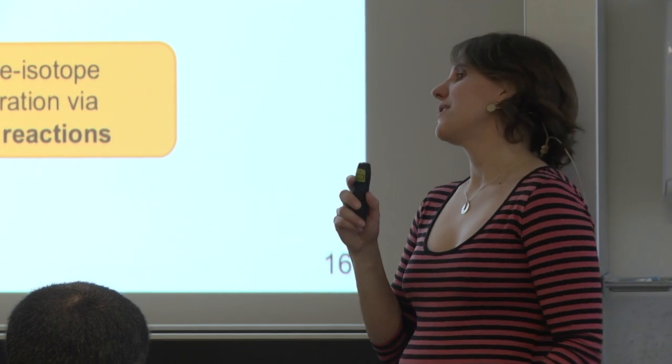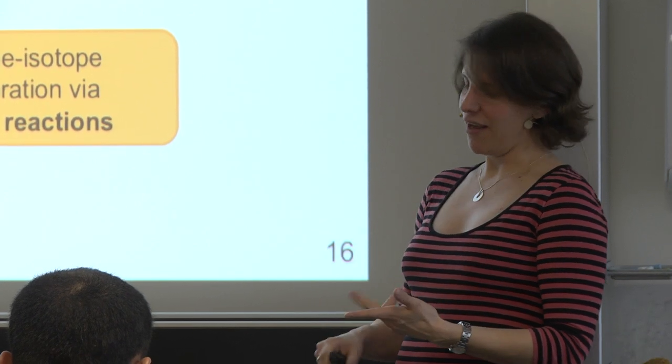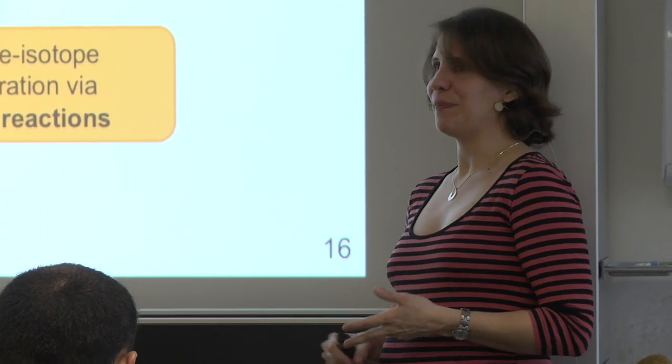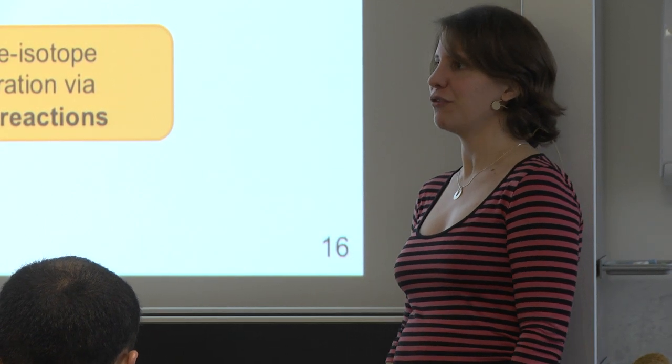Ideally housekeeping proteins. If this doesn't exist, a protein standard that you spike in as early as possible. If you don't have this, a peptide standard, whatever. The earlier you do it, the better you will be able to account for it.